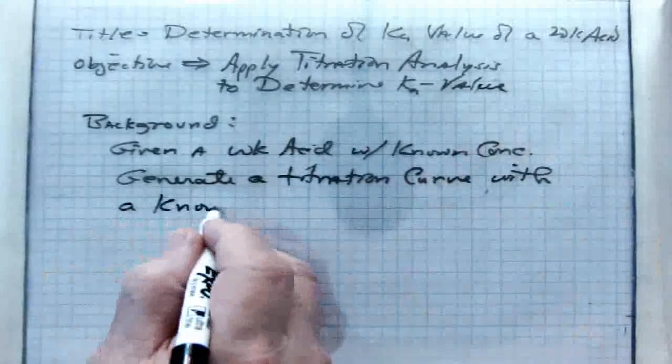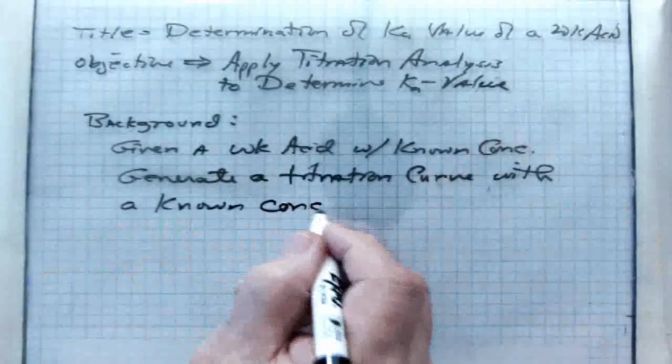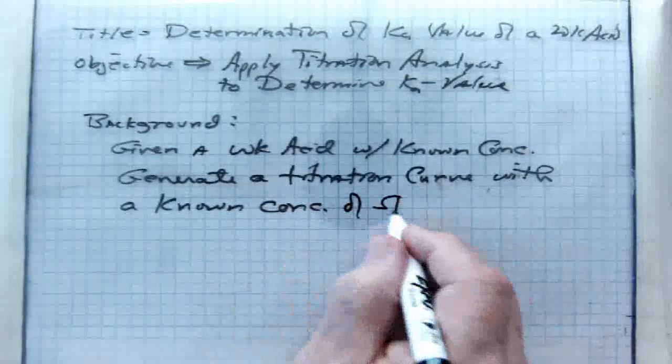So we're looking at a strong base weak acid titration.